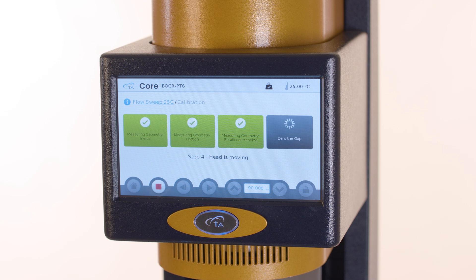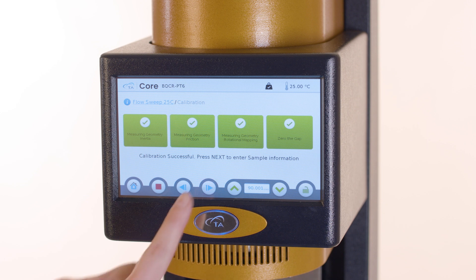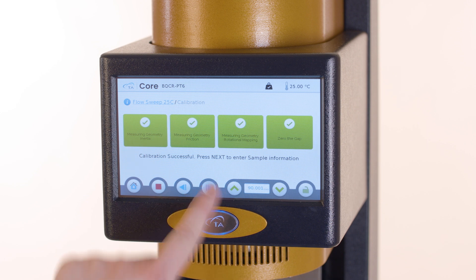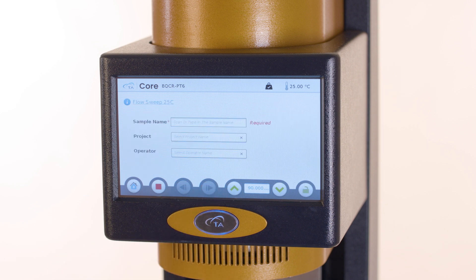Once the calibrations are complete, as indicated by green boxes with check marks, press next to enter the sample information. Enter the sample name.